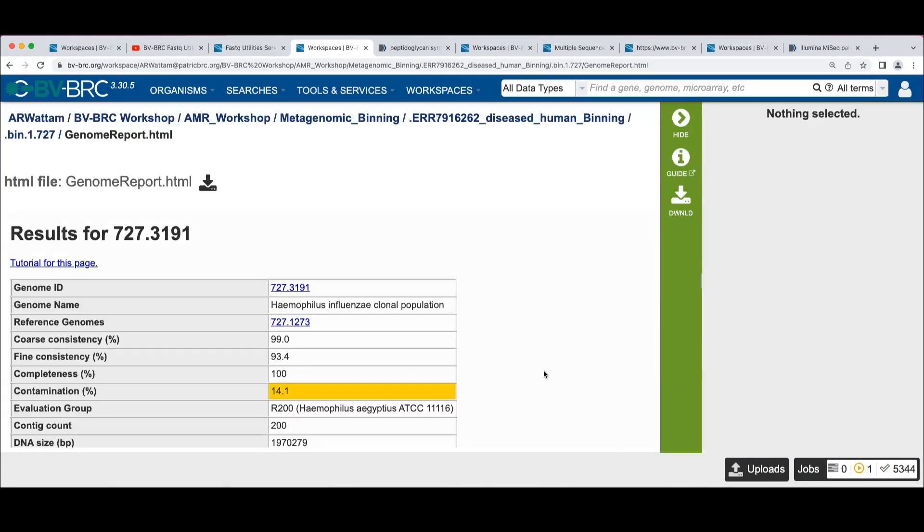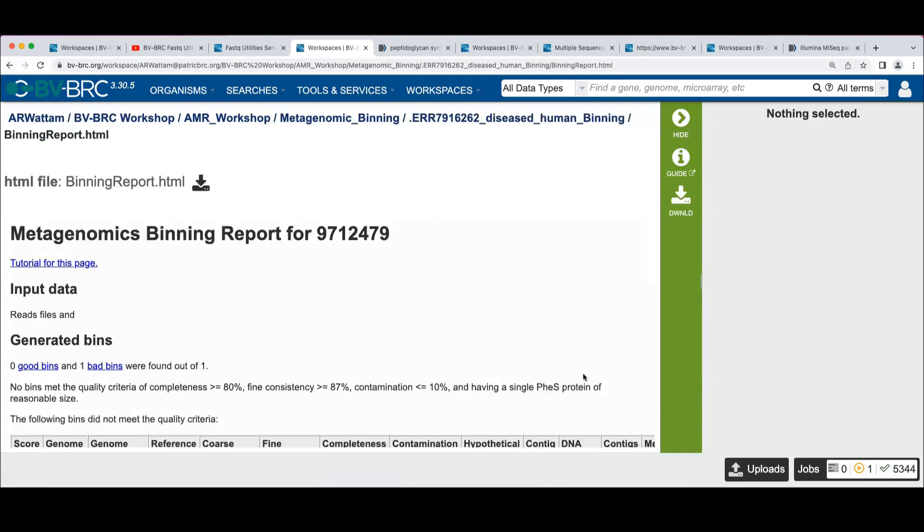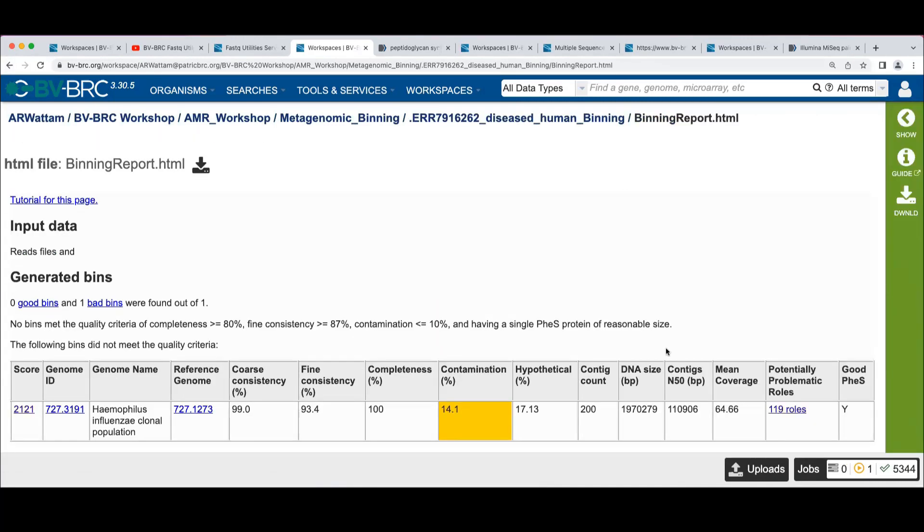So I clicked on that link. Do it again less quickly. Click on this link that says potentially problematic roles.